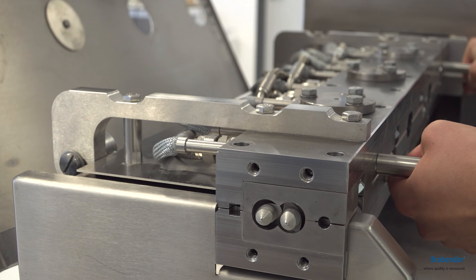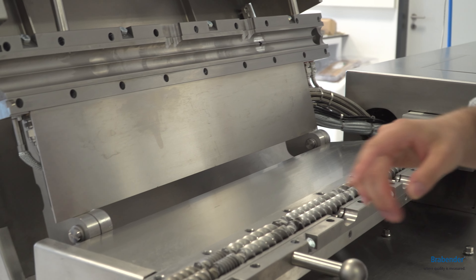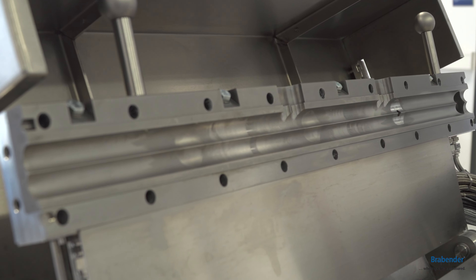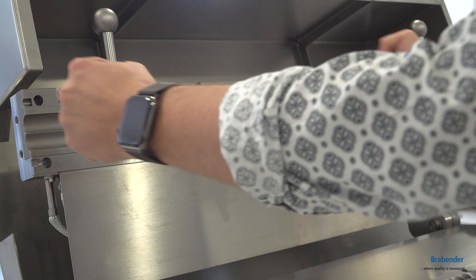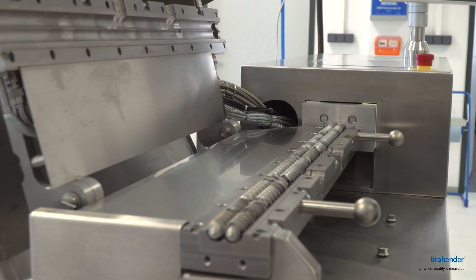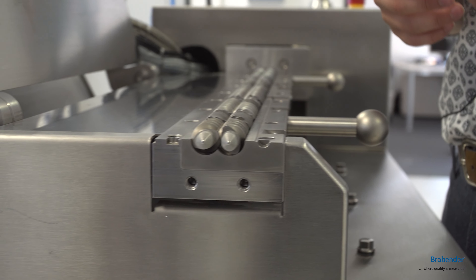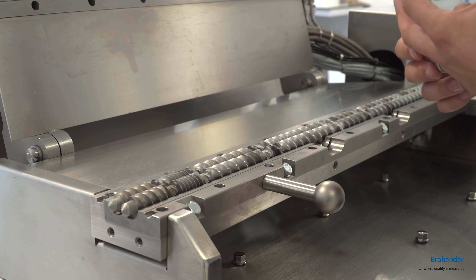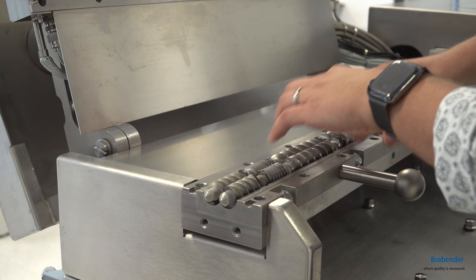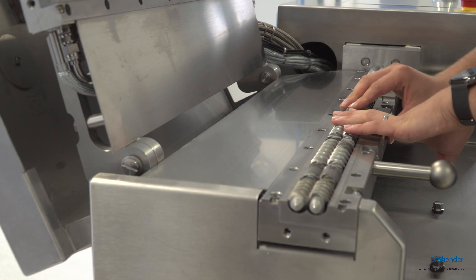Another huge advantage of our compounder systems is that by removing only these eight screws — four on top and four at the bottom — you have the possibility to detach the whole liner. This comes in handy for customers who want to use the compounder for two completely different processes: one that is very abrasive and one that is very corrosive. For these processes you need different steel grades, and therefore you can simply detach and replace the liner as well as the screws with different steel grades instead of buying two separate systems.